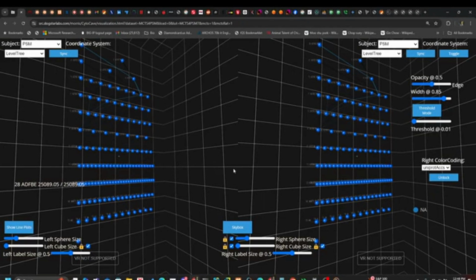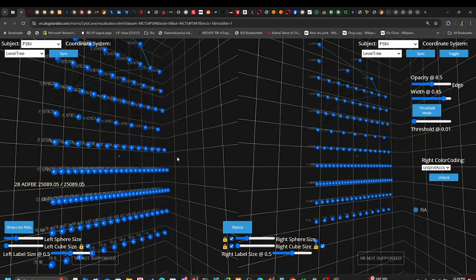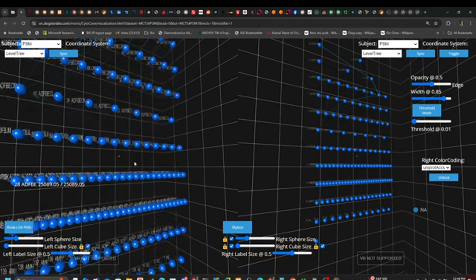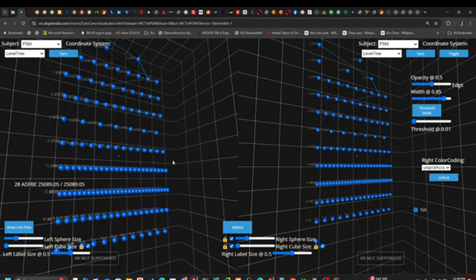This is the CytoCaveMCTS protein complex assembly structure prediction visual analytics tool. It visualizes the output of the MOLPC pipeline, which uses MCTS to assemble AlphaFold trimers into protein complexes up to 30 chains.